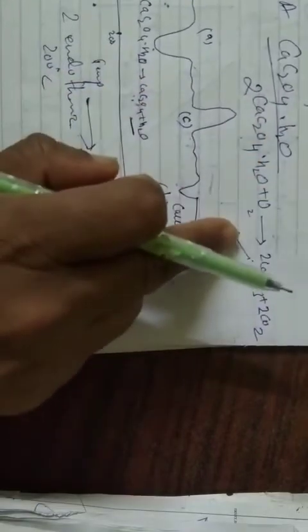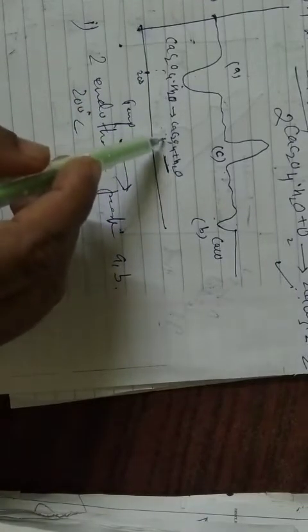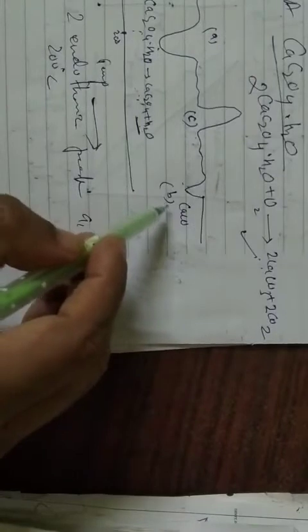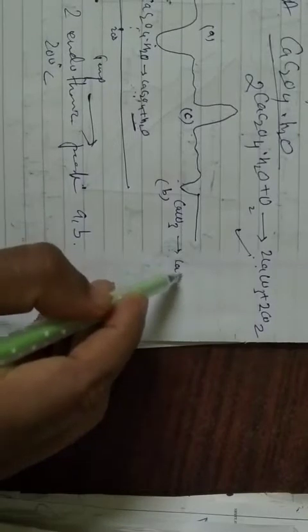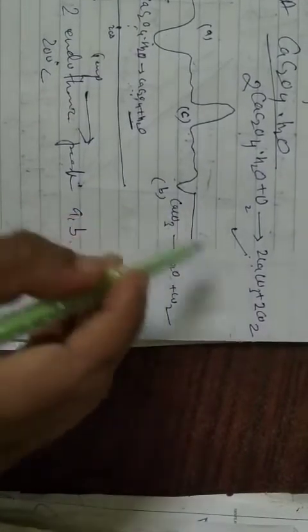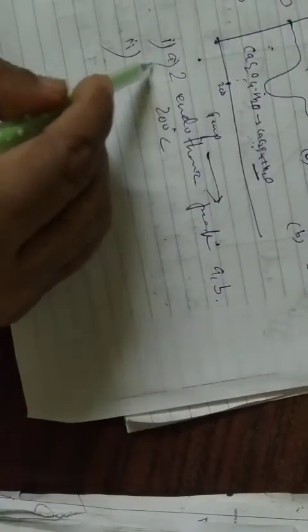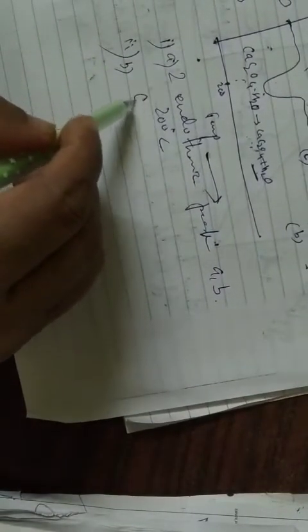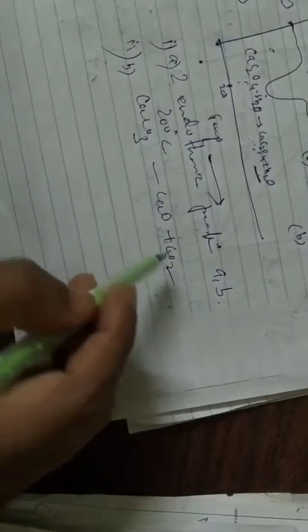Now you can see the first peak corresponds to calcium oxalate monohydrate converting to calcium oxalate and water, and finally the calcium carbonate, CaCO3, that is formed is decomposed to calcium oxide plus carbon dioxide, okay. So this is how it is happening. A is the dehydration, and in B, CaCO3 is converting to calcium oxide and carbon dioxide.